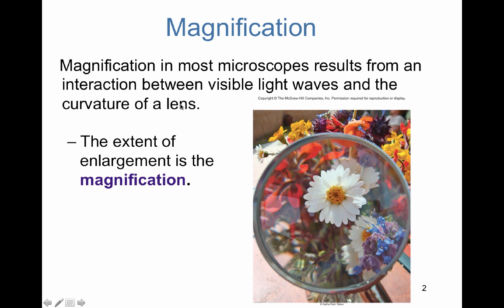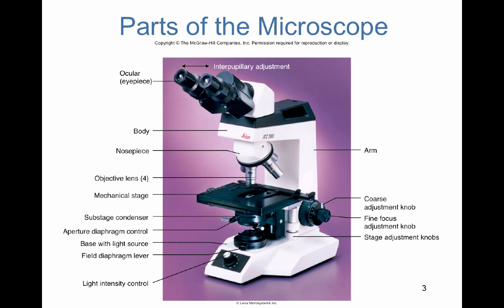All right, so I'm going to talk a little bit about the mechanics of how the scope works. Now, we worked with this microscope in lab if you're in the on-site course, but for the online guys, you have a different version of the scope. It's a monocular, so you don't have two ocular eyepieces, you only have one. But basic parts are the same.